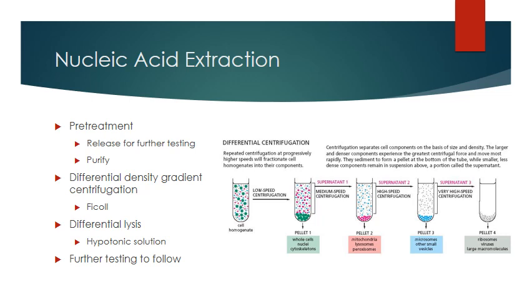Now you don't have any other cell but the white blood cells left, and you just gather them into a button, leaving your lysed red cell components in the supernatant, and you can just pour those off. Once you've done that, now you have purified your cells, and you'll have to go through the next step in order to complete the testing. So this is one part of the procedure, a fairly extensive part of the procedure.